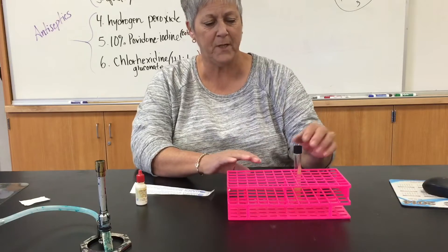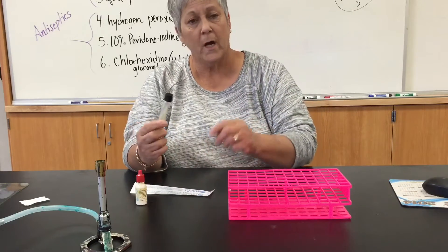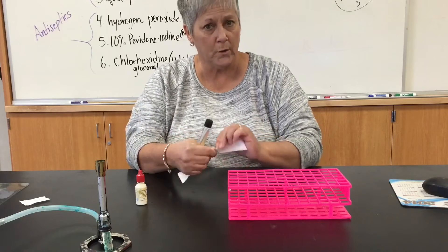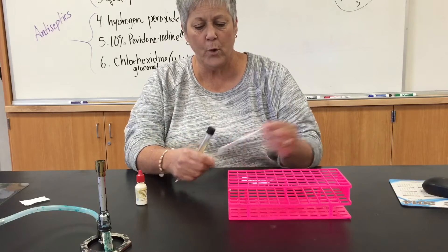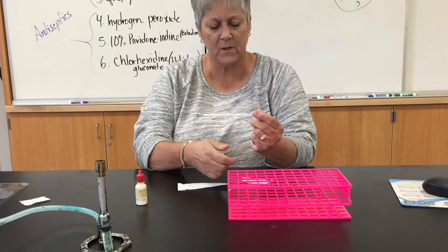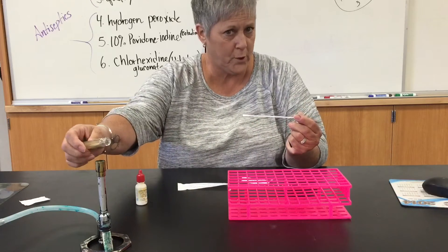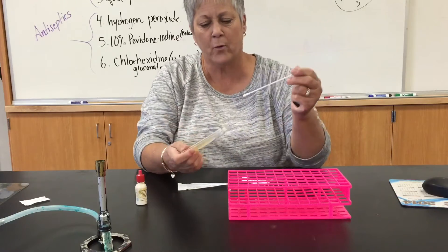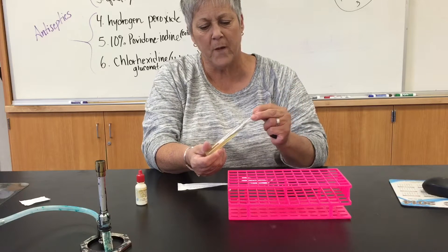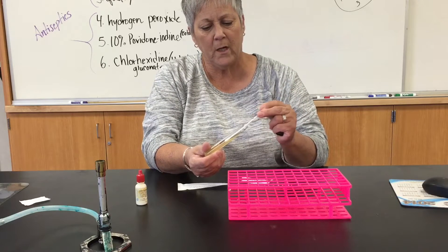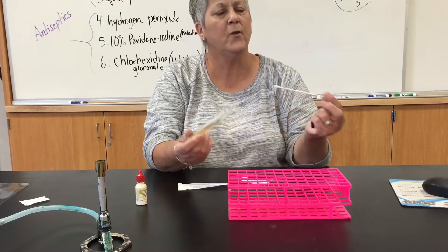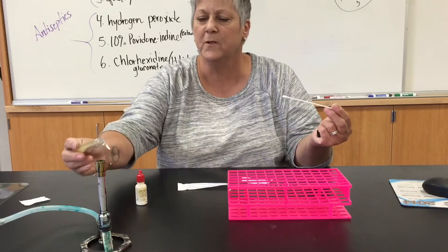Using aseptic technique, I would inoculate my slant with a sterile swab and I would want to cover the entire surface of the slant — just pretending here — with microorganisms. I would go in with a swab full of the test organism and streak it up the entire length of the slant, trying to cover the entire surface area.